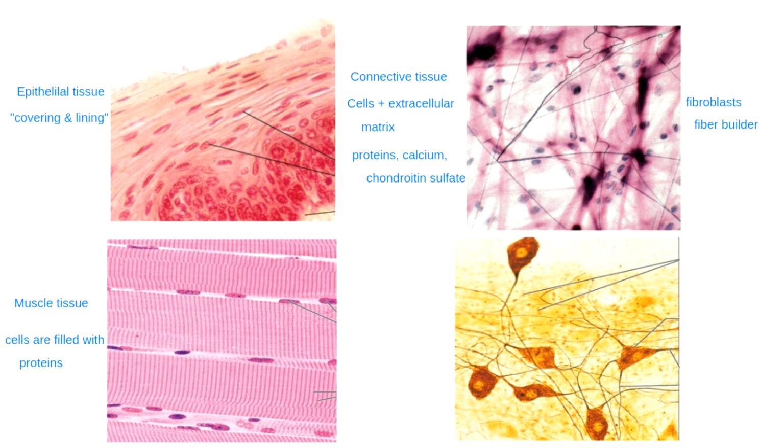So I can see in my picture here my fibroblasts, and then I've got these dark protein fibers, these thick pink protein fibers, and some really skinny protein fibers. The big idea with connective tissue is if you see a bunch of different proteins or a bunch of stuff on the outside of the cells, that's connective tissue. It's got a bunch of stuff outside those cells.